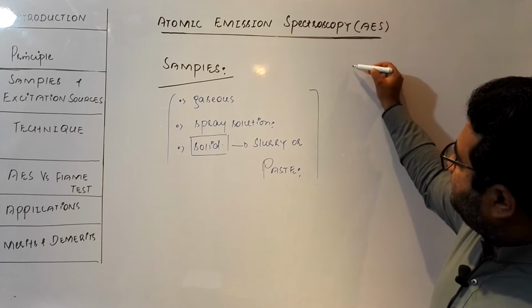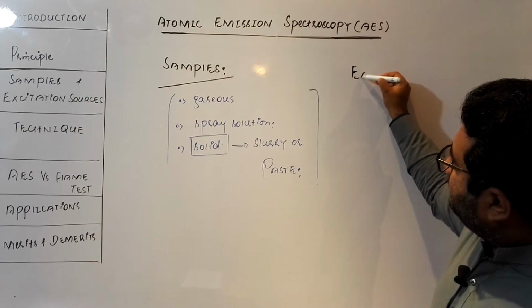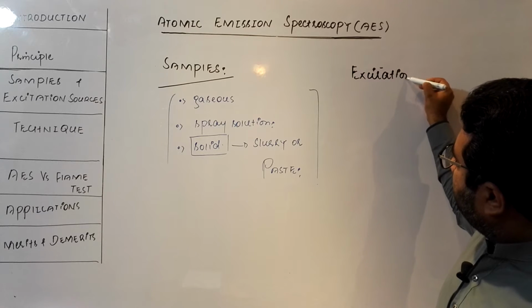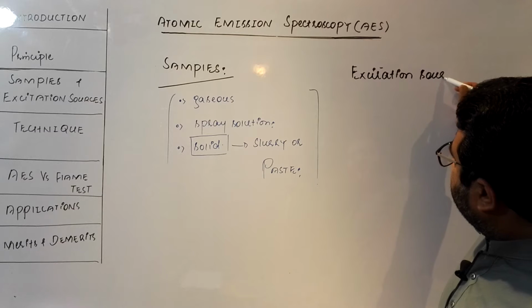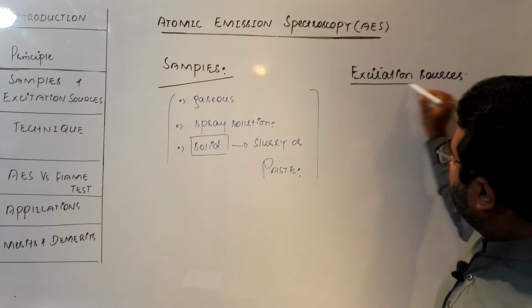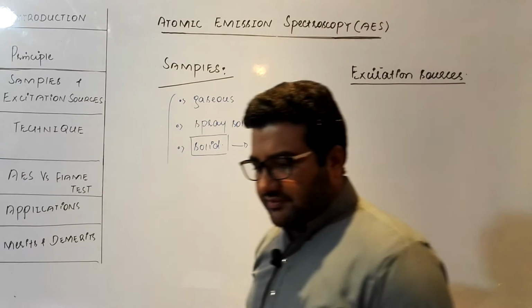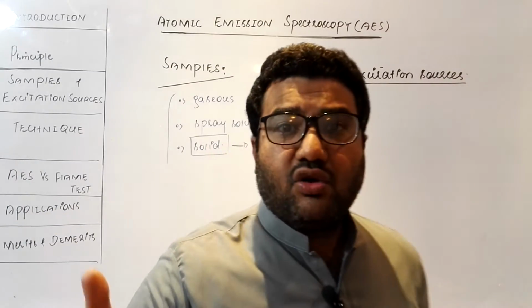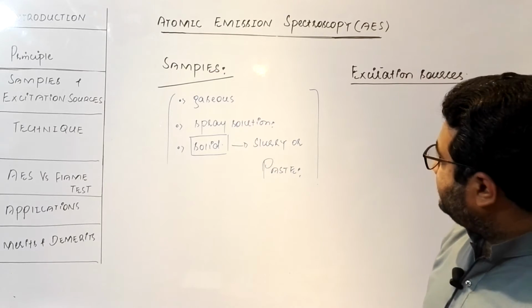Now what are the excitation sources? Excitation sources means what can be the sources that can cause excitation of the electrons.